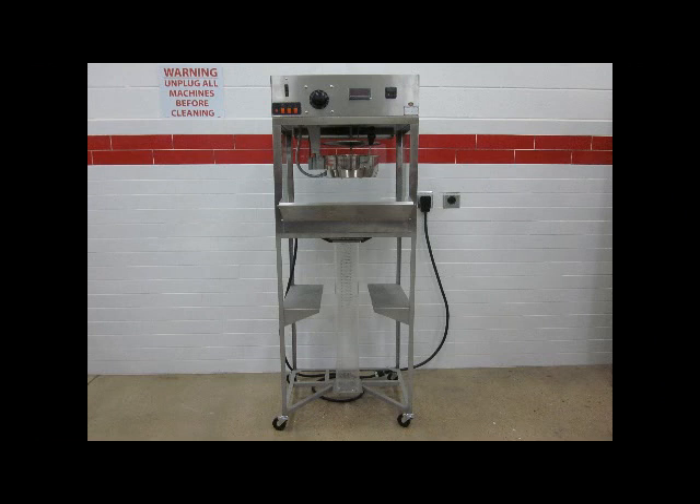The Critter's metric weight volume tester, MWVT, has been produced under the guidelines of the Popcorn Institute. The tester is used to determine the expansion of a popcorn sample under tightly controlled popping conditions.